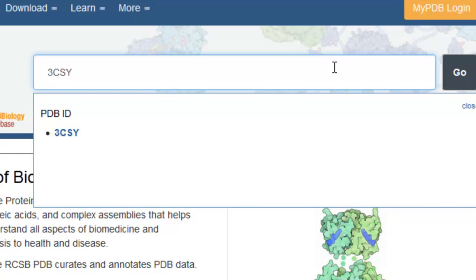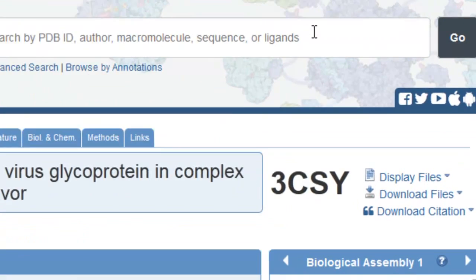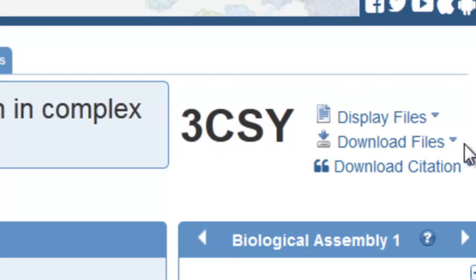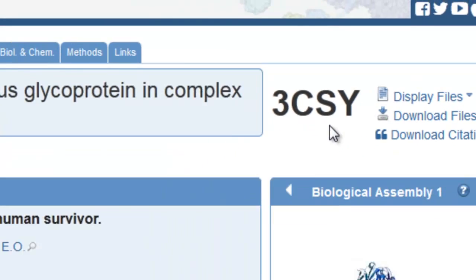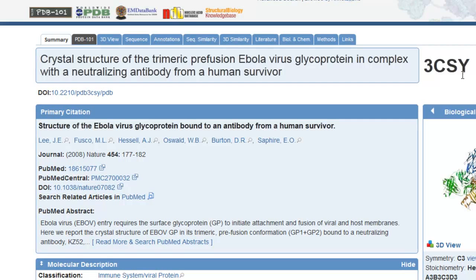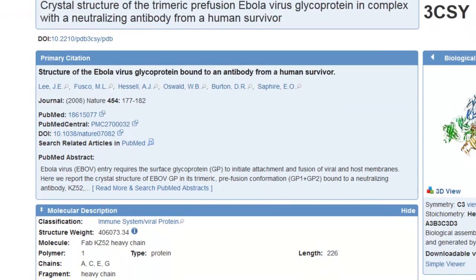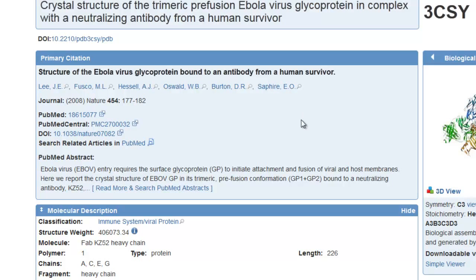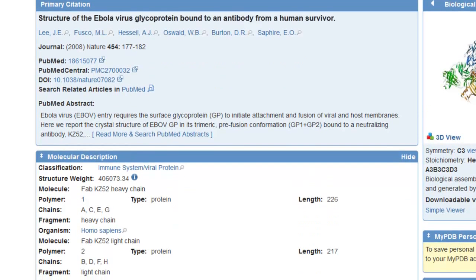Each protein is always identified by a 4-character code, usually 1 number and 3 letters, though it might not always be 1 number and 3 letters, but it's always a 4-character code. So here we have the structure that we want: Crystal structure of the trimeric pre-fusion Ebola virus glycoprotein in complex with a neutralizing antibody from a human survivor. This study was published in Nature a couple years ago by a very prominent lab run by Erica Sapphire at the Scripps Institute.